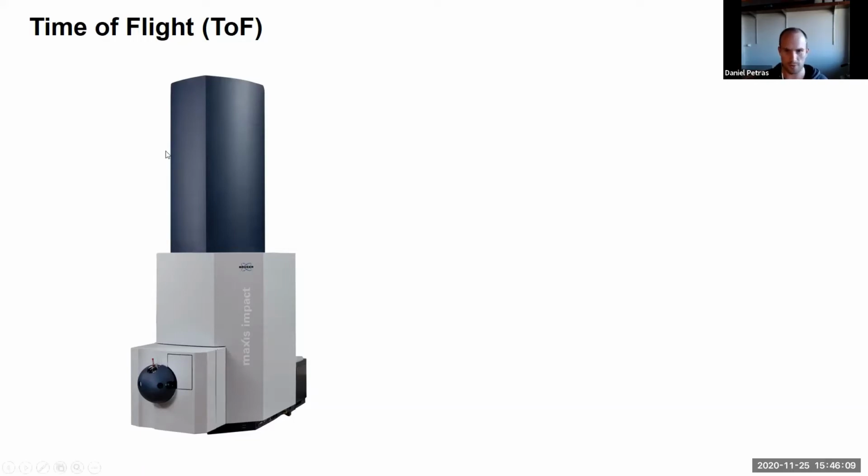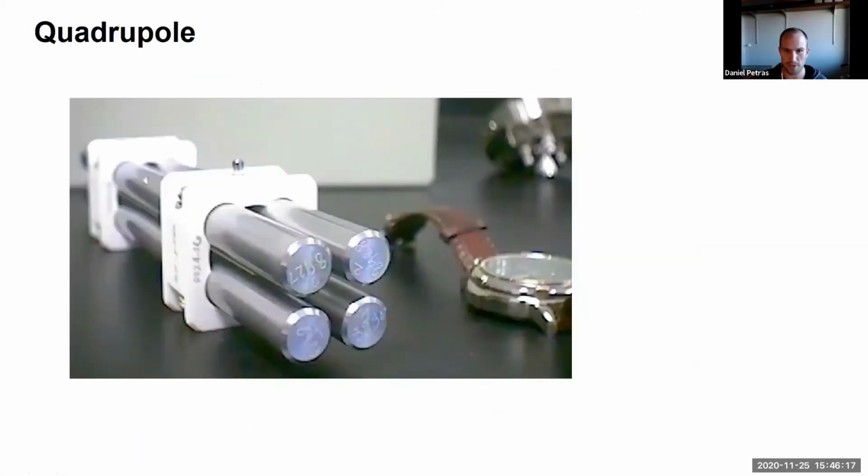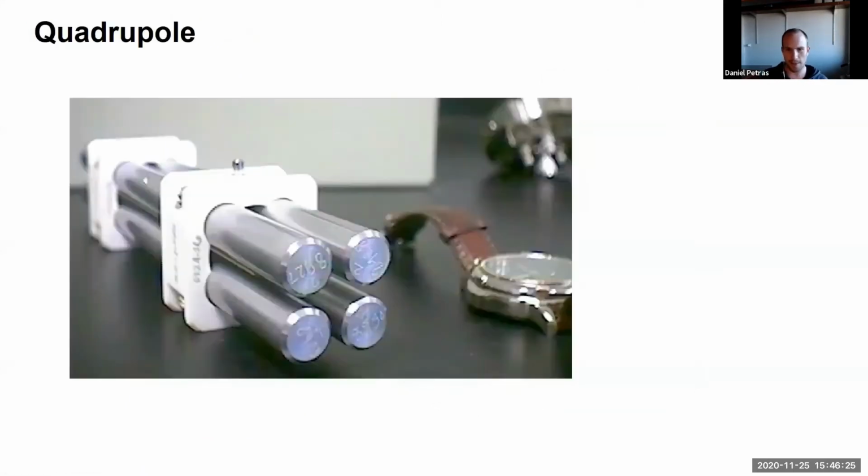This is one we have in the Dorstein lab, where we actually have such a flight pattern. It's basically the principle I just showed you in this animation. Then here in the very front of this mass spec, there's actually a second mass spec, and that's a quadrupole, which is a different analyzer, and in some instruments it's combined to pre-isolate ion packages. And in a second, I'm also gonna tell you what this is very useful for.